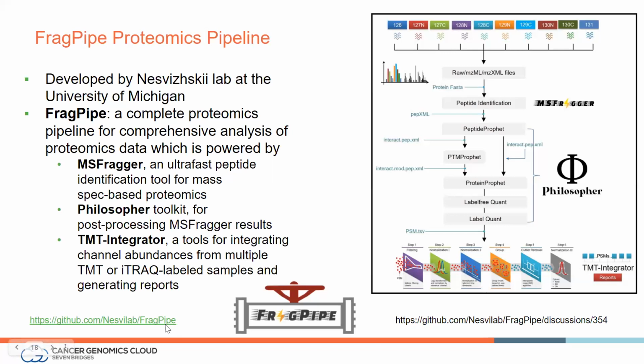Anyone can use them. They are free. We don't charge for people to use them. FragPipe and MSFragger are also free for academic usage.